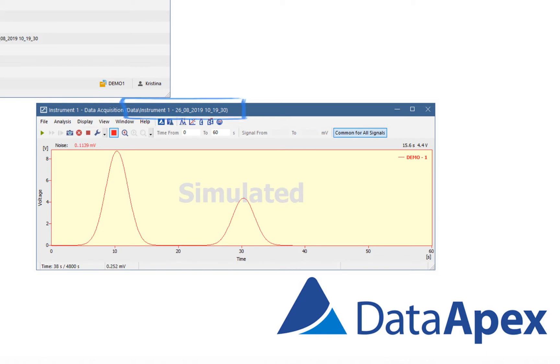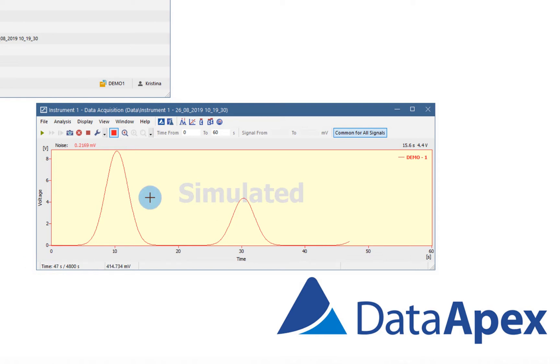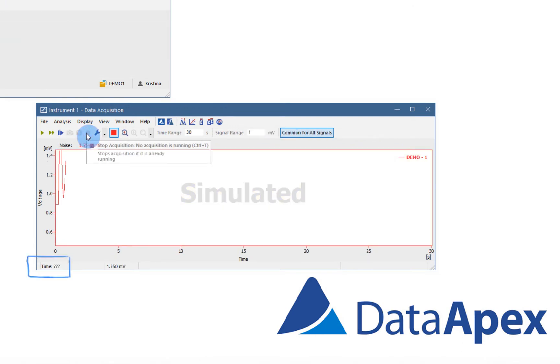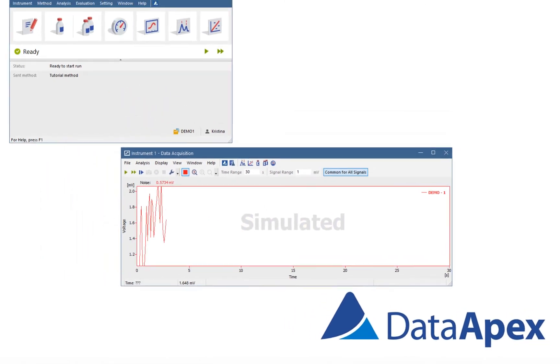The name of the measured chromatogram is displayed in the window header and elapsed time of the running analysis is displayed in the status bar below the graph. If the acquisition is not running, three question marks appear.